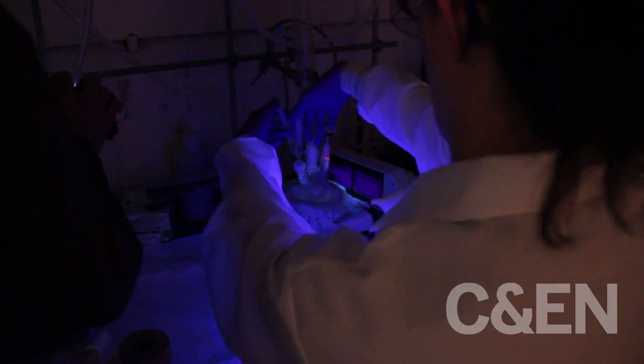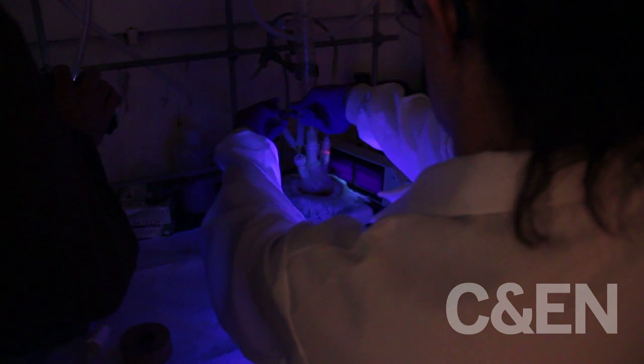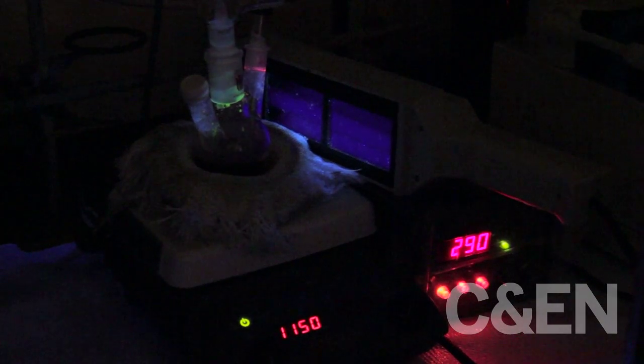Now I am injecting the selenium and you can see the color changes immediately. I'm going to lower the temperature to 290 degrees to anneal it. You can see in the beginning it fluoresces green, but as it heats up it turns to a more red color. Now we just wait about 12 minutes while this anneals.